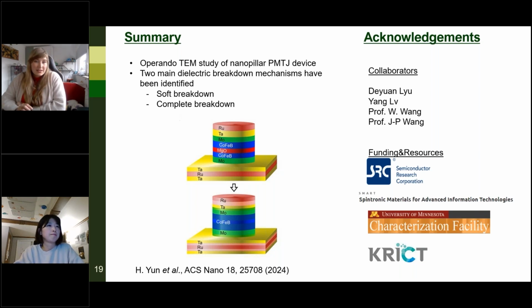Indeed, some papers are a little bit more TEM oriented, some are more applications oriented, and this is definitely more applications oriented. Somebody else is asking, let me see, there's quite a lot of questions. Do you have any idea of the sample thickness at the analyzed region?